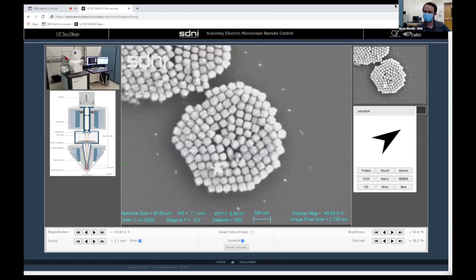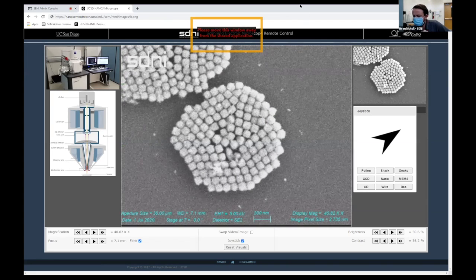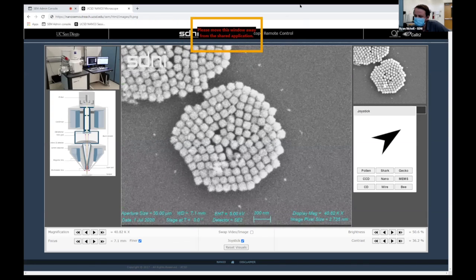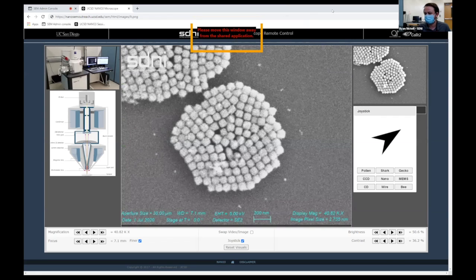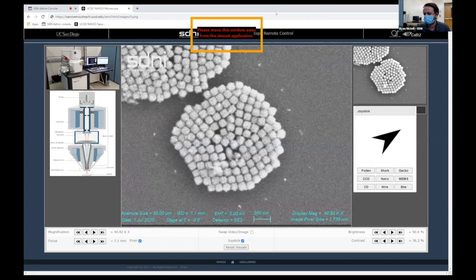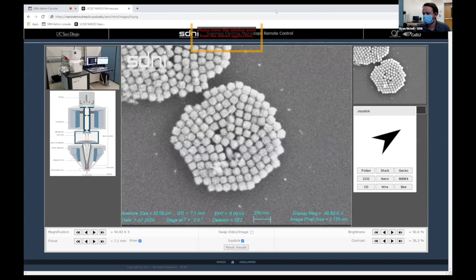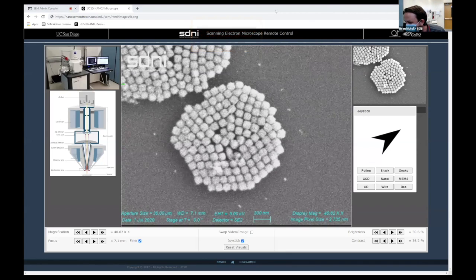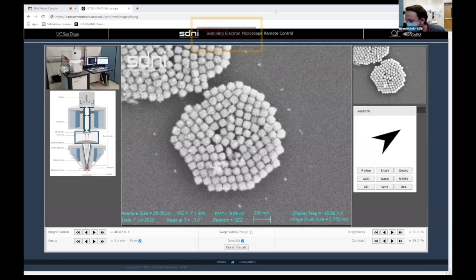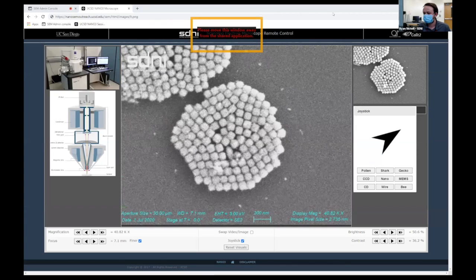No, I think that answers that. Ryan, do you want to switch operators? Or Dustin, can you hand it over to, I think the next person is Joanne? Let's see here. Joanne can request maybe? I'm not sure. I could stop remote control. Let's do that. Let's stop and then I can hand it over. Okay, great. That'll work. Do I request it or do I wait for you, Ryan? This is a good question. Sorry, who am I sending it to? This is Joanne. Sorry, what's the name? Joanne. Joanne. Yeah. Okay. Does that work? Did you get a request?